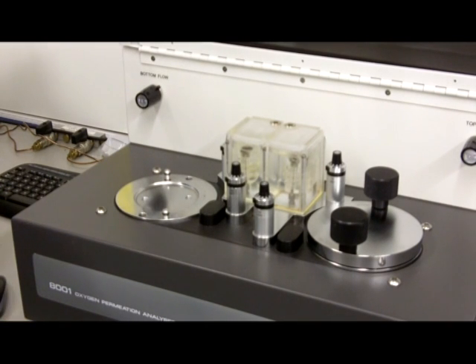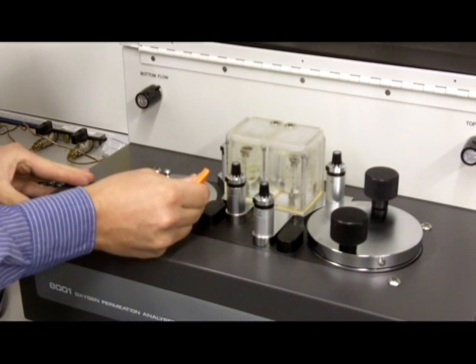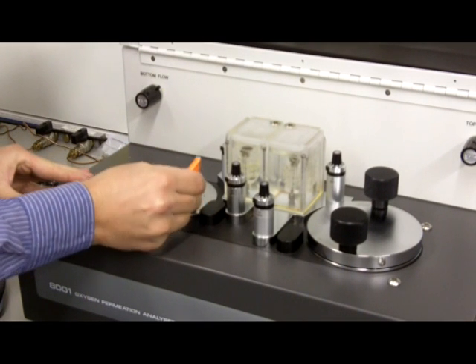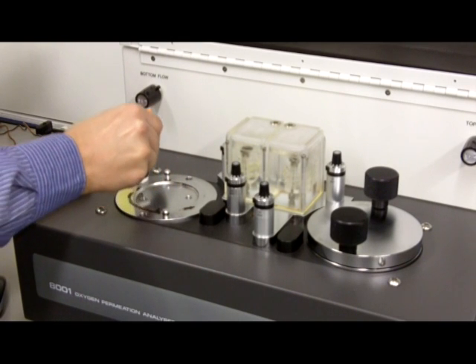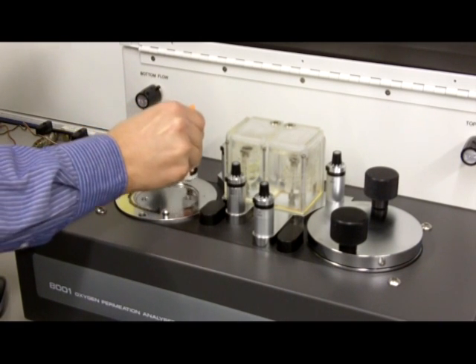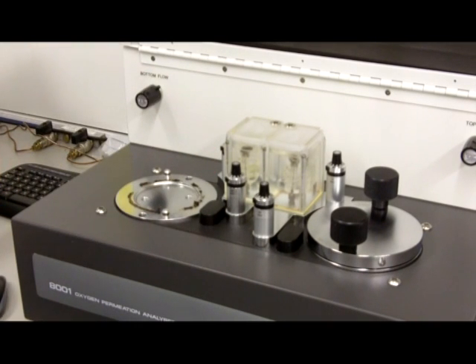We then apply grease for an airtight seal. Smooth it around the chamber edge.